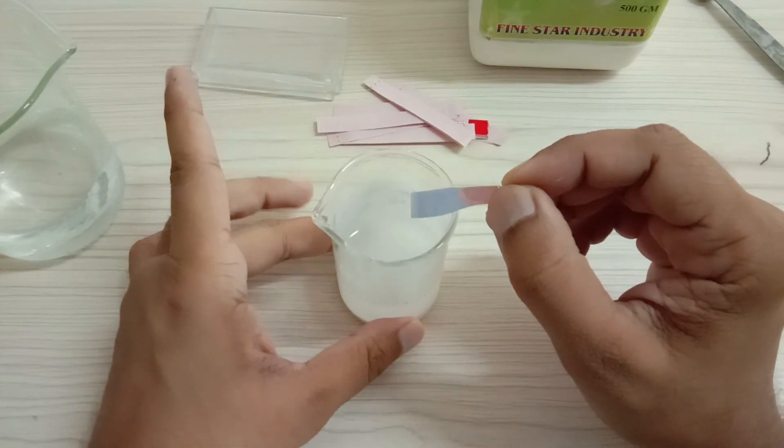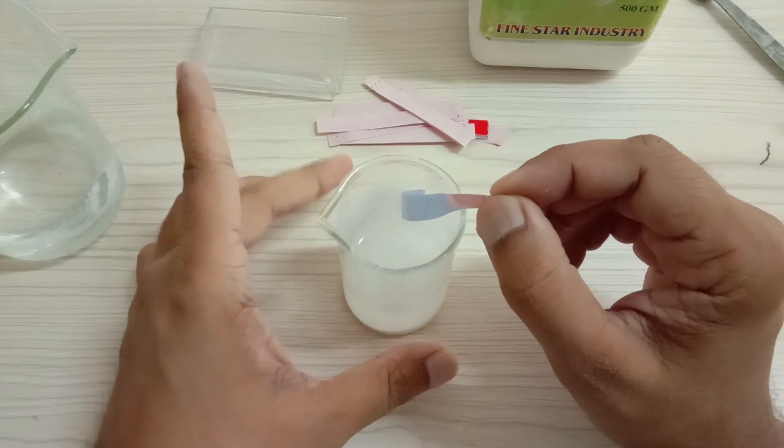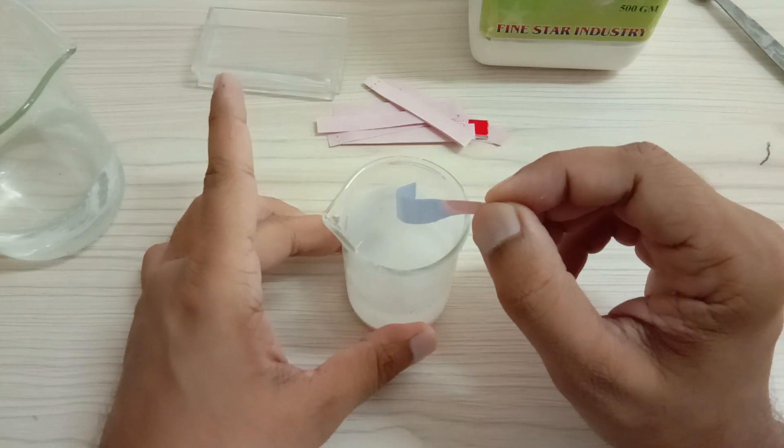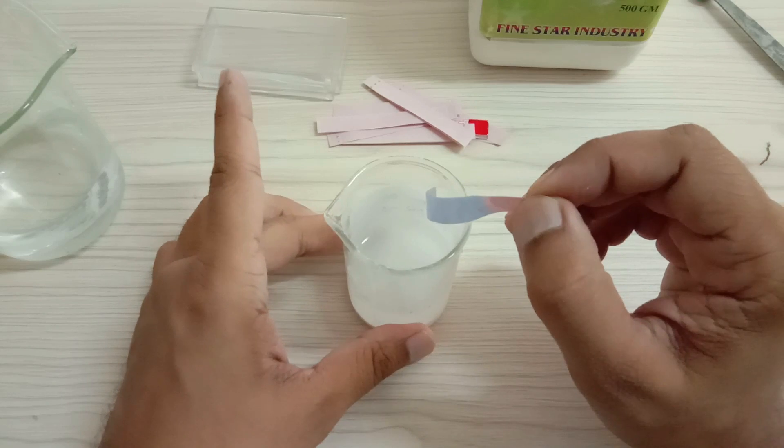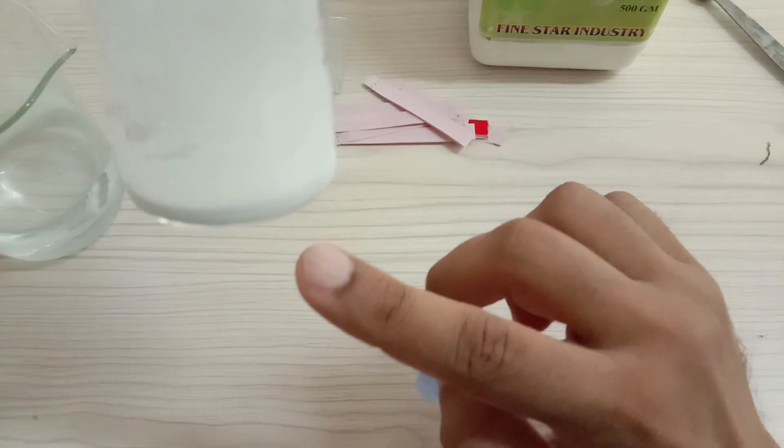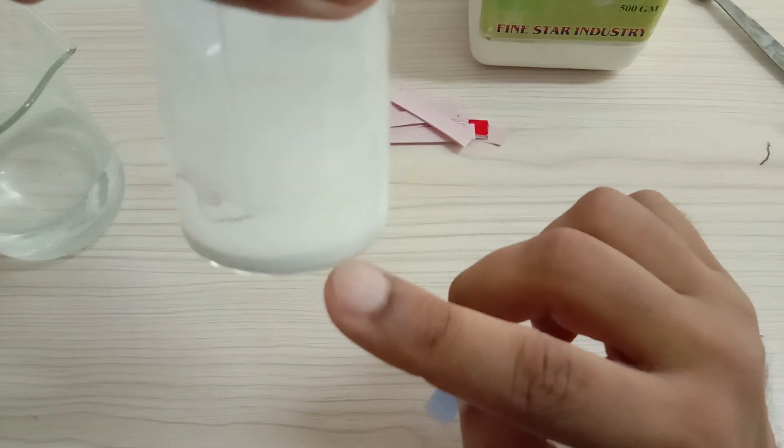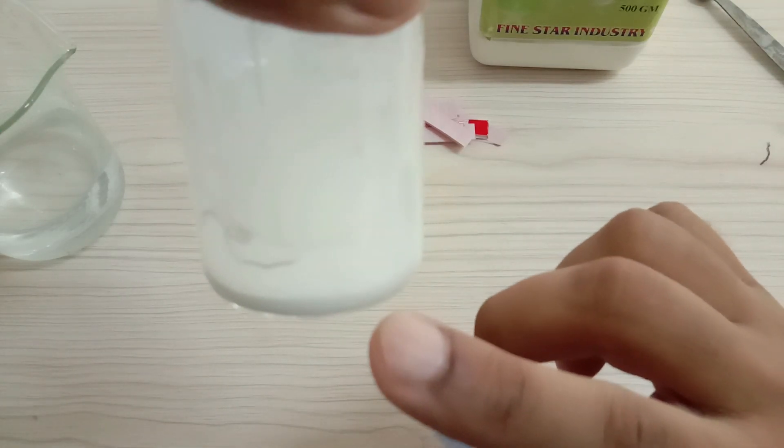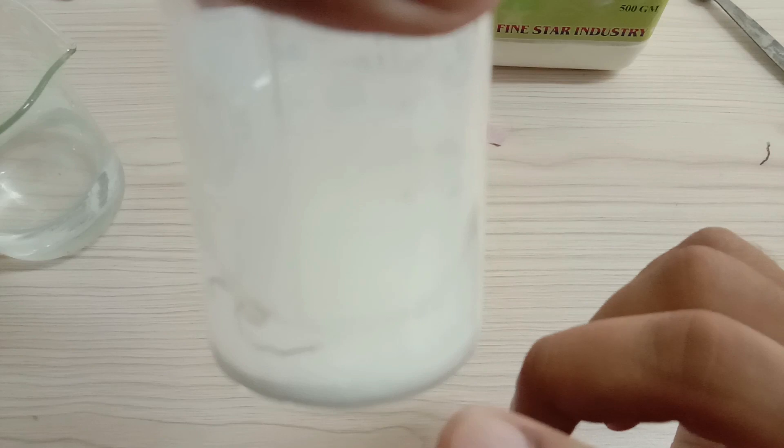Now I am hardly able to feel the warmth over here, but yes, there is some amount of heat being evolved, but not that much. And guys, you can see that most of the salt has settled at the bottom because calcium oxide is not fully soluble in water. You can check by yourself.